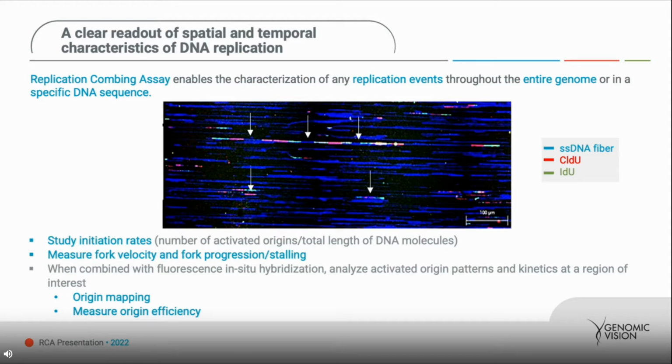So several different parameters can then be assessed with this technology. We can assess the initiation rates, the fork velocity, the fork progression, but we can also combine this technology with FISH probes to then analyze activated origin patterns and kinetics at a region of interest.